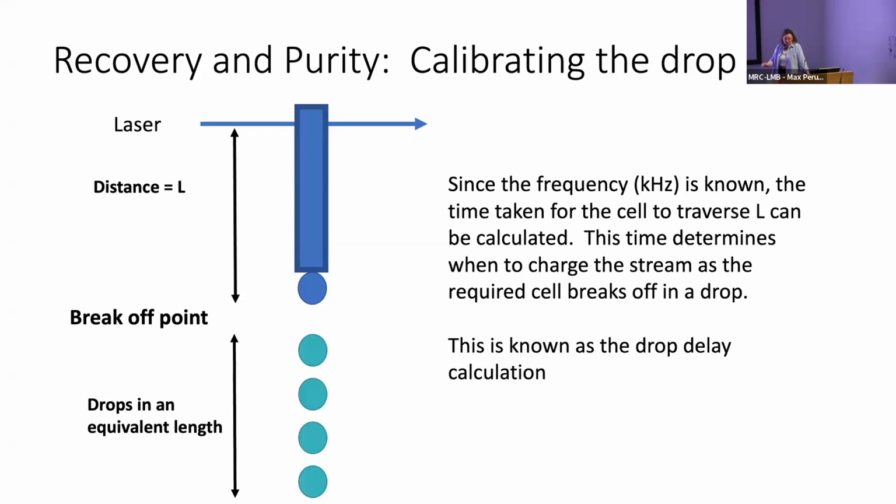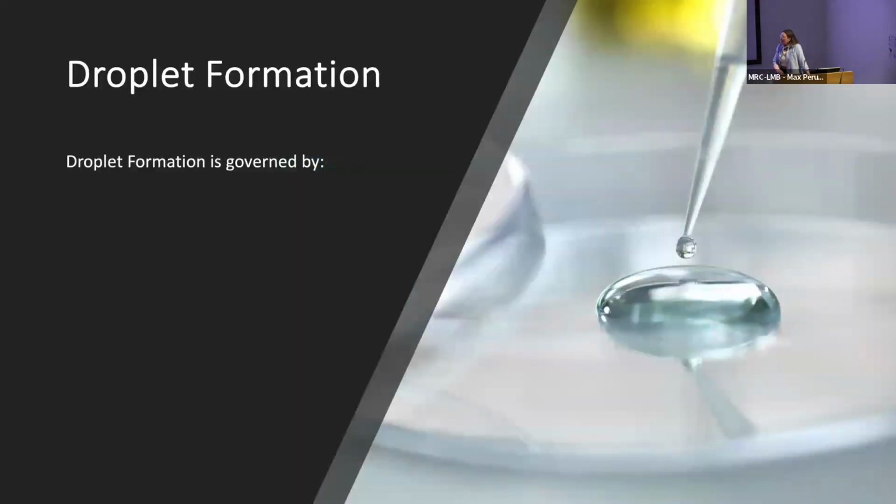So that's one of their advantages as well. So a couple of the things that affect droplet formation. The first I've already touched upon is the transducer frequency, which again can range from anywhere from 20 to 90 kilohertz, sometimes actually almost up to 100, depending on the system. If you imagine the vibration of the transducer, the lower the vibration, so once we get down to say 20 kilohertz, the droplets are much bigger. And then the higher it is, clearly the droplets are much smaller.